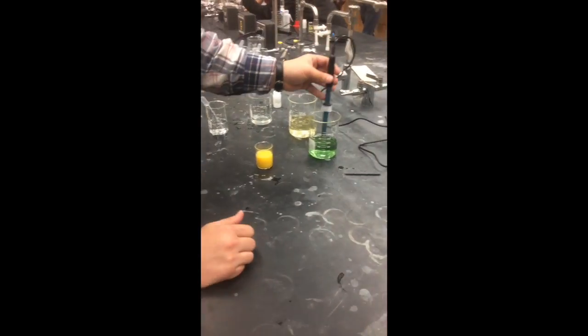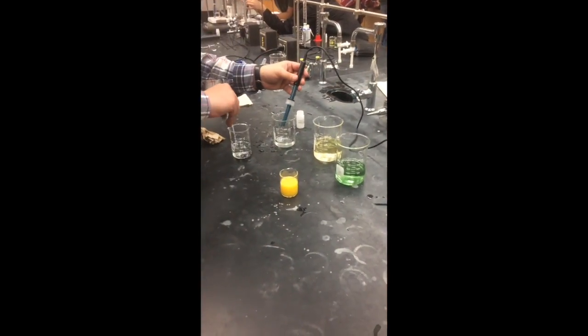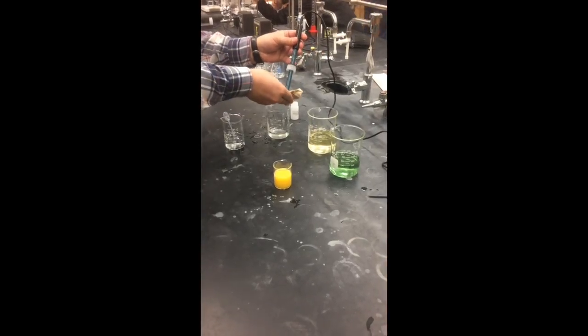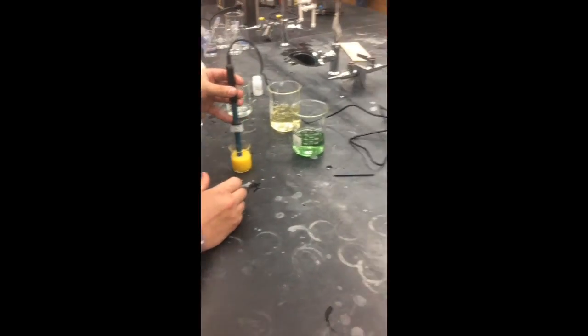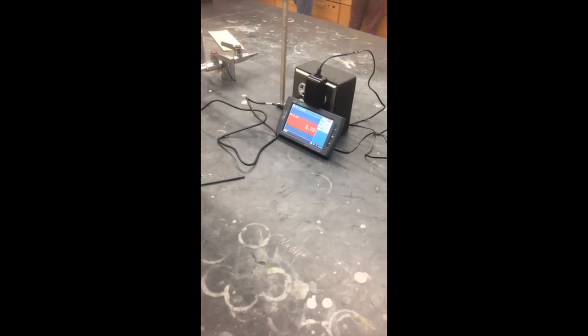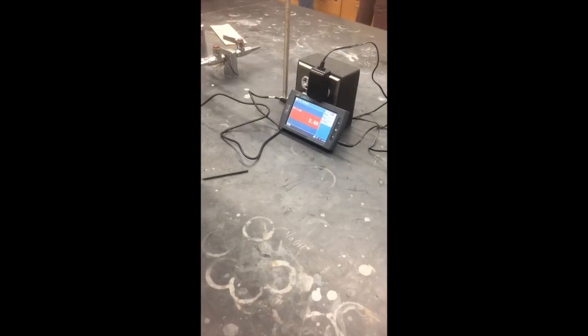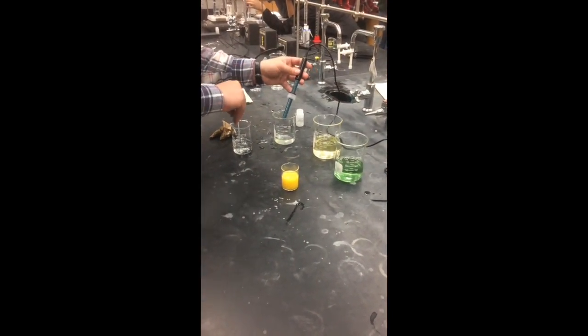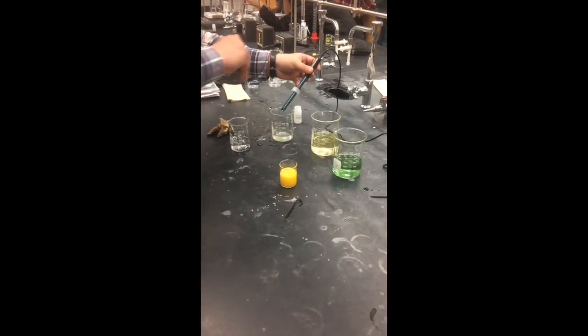Now, make sure you test that the pH meter is calibrated properly by putting it in one of the buffer solutions. Here, we used pH 7 buffer to test if it was accurately calibrated. Next, we tested the pH of an unknown solution and recorded the data. Wash again with deionized water and blot dry.